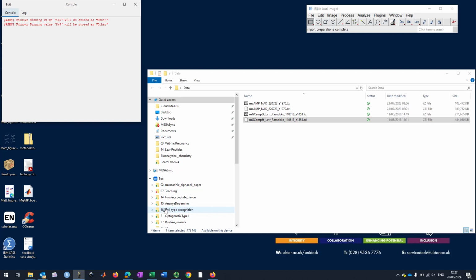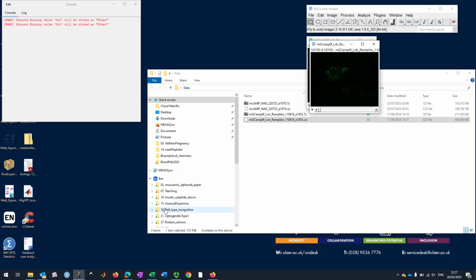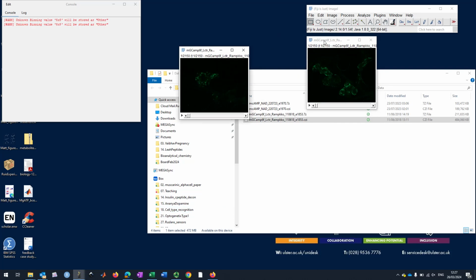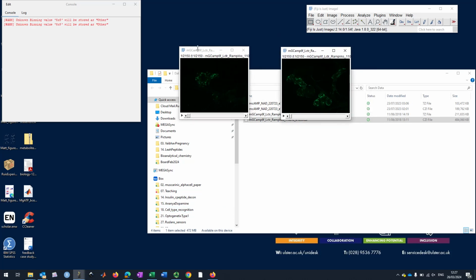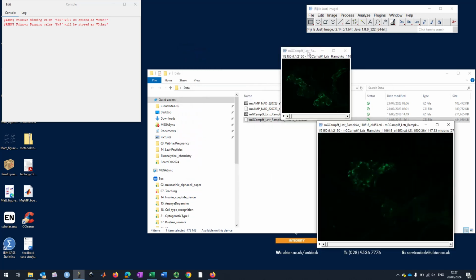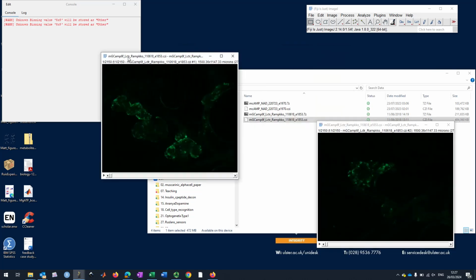You can see that it works hard to load them. You can barely see anything in here. There are two files, 1 and 2. I click that and I click up. That's number 2. I click that and I click up. That's number 1. Let us do the following thing.